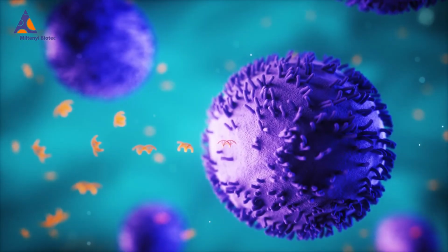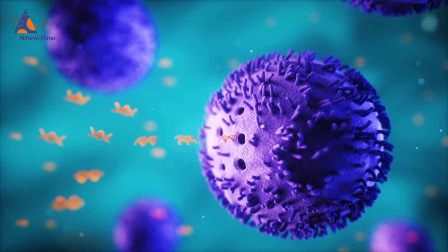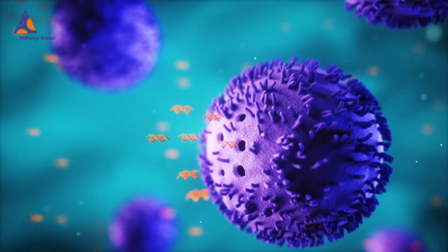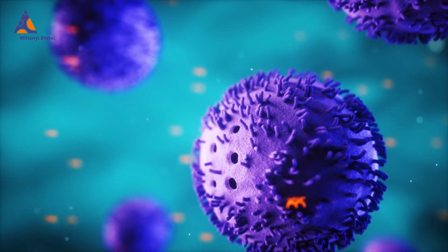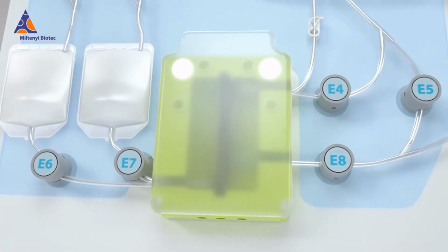Now the electrical pulse is administered on the cells. This pulse creates temporary open pores in the cell membrane through which the nucleic acid can enter the cell. This entrance can be supported by a second electrophoresis pulse. The cells are now transfected with the foreign nucleic acid. Depending on the conditions, a transient or stable transfection is possible. The pulse settings can be adjusted via the user interface.